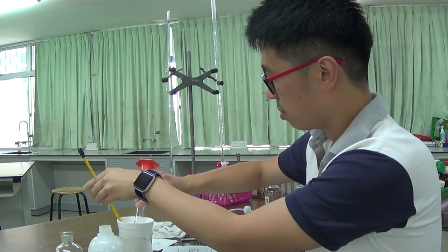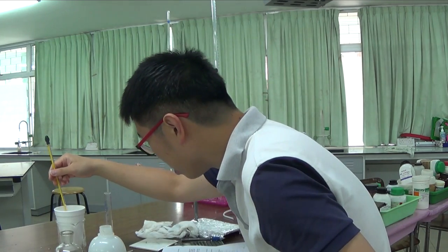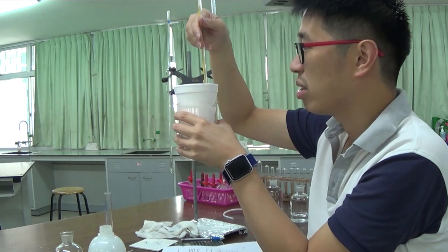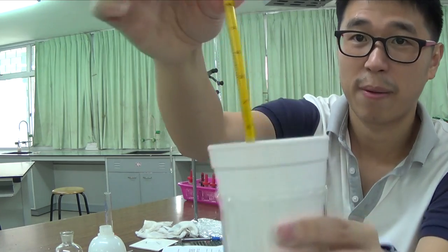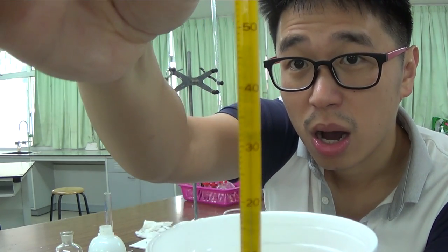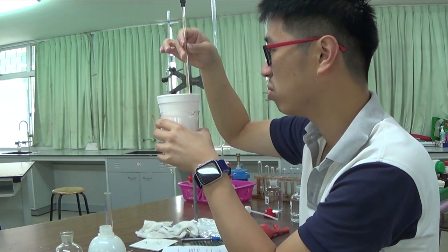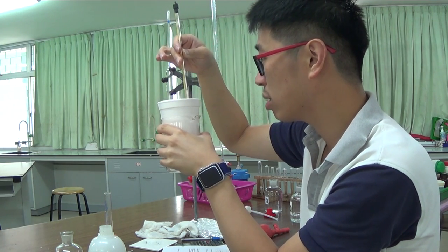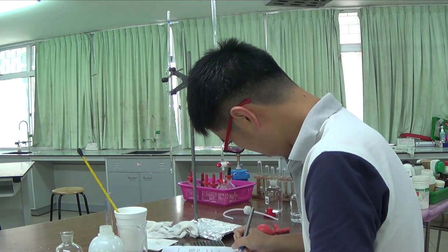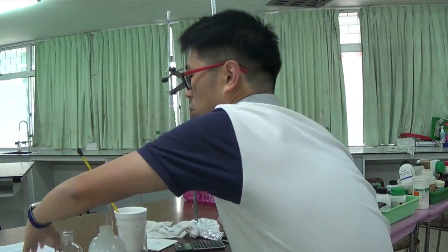Mix them in and then we'll find out what is the maximum temperature rise. So the temperature has risen to, well, it was fast, it's risen to 32.0 degrees Celsius. It's not very clear, obviously, okay? But anyway, it's clear on my side, so when you have the chance in the lab, you should really do this kind of experiment. So there's 32.0. It's 10.0 degrees Celsius temperature difference, okay? Yeah, but I will show you only 10.